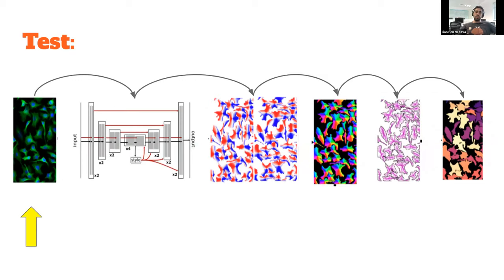When coming to segment an image, you take the input image and pass it through the U-Net, which predicts the vertical and horizontal gradients. You mesh them together, and from that map of gradients, you want to extract the outline of the cell in order to do the segmentation. They developed a process they call "follow the flows."